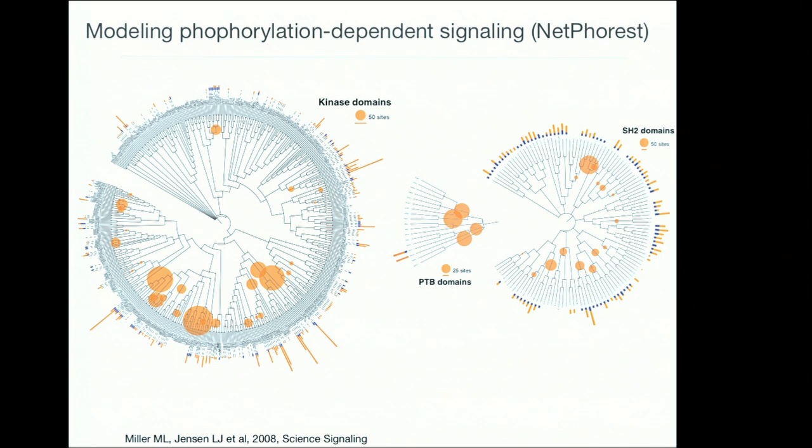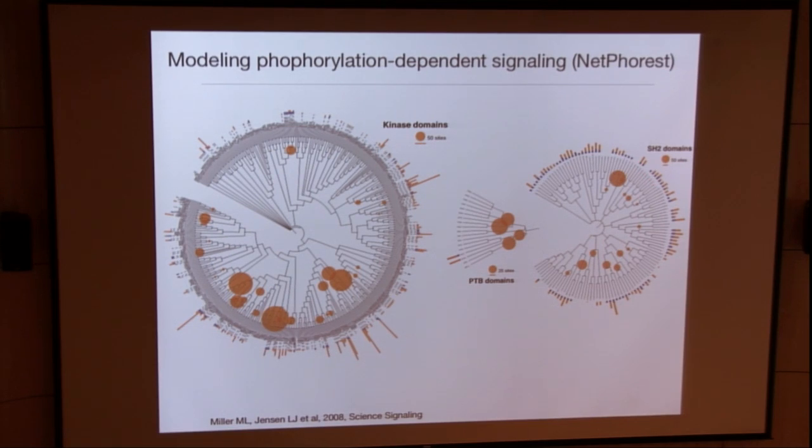And we also, in blue here, have additional data which are either kinases or SH2 domains that had been profiled in vitro for their sequence recognition motif. So we also mapped that onto the trees just to get an overview of what we had.